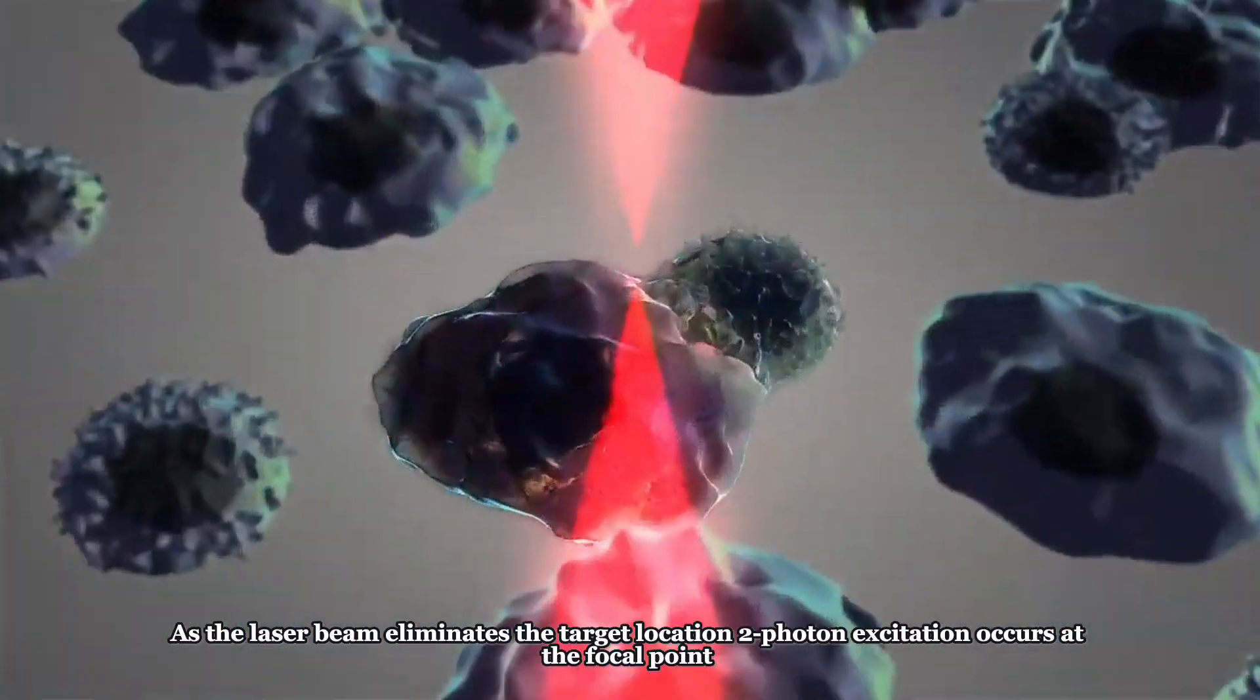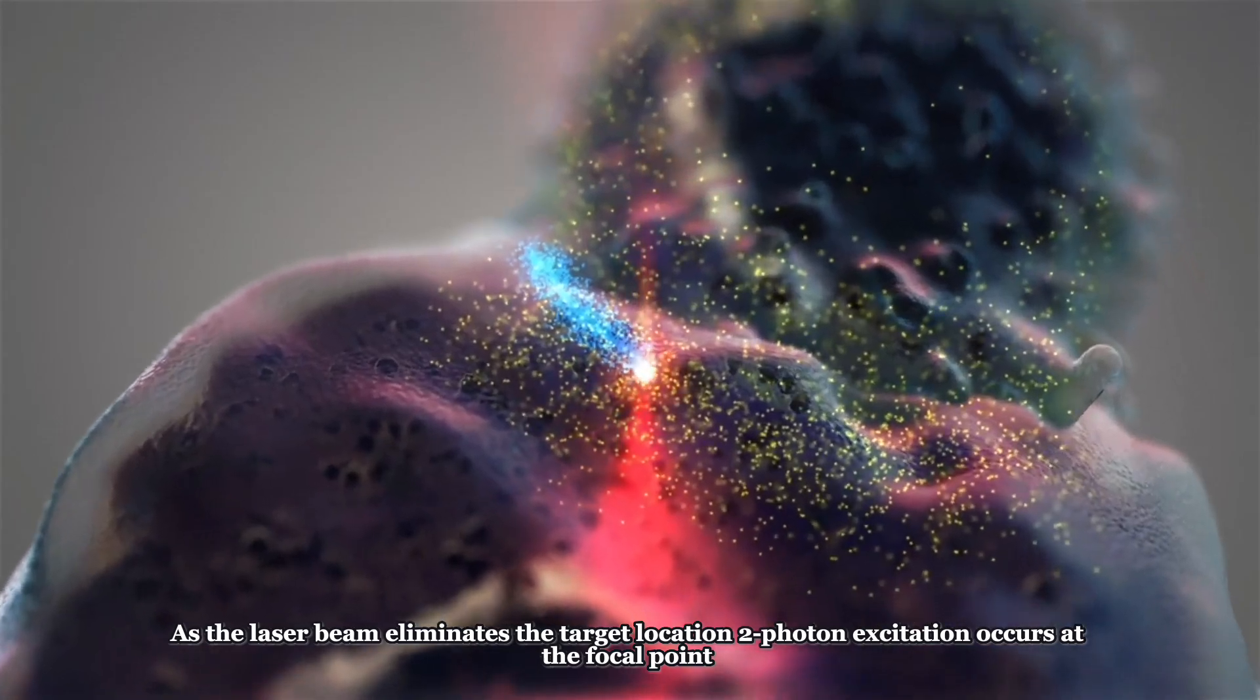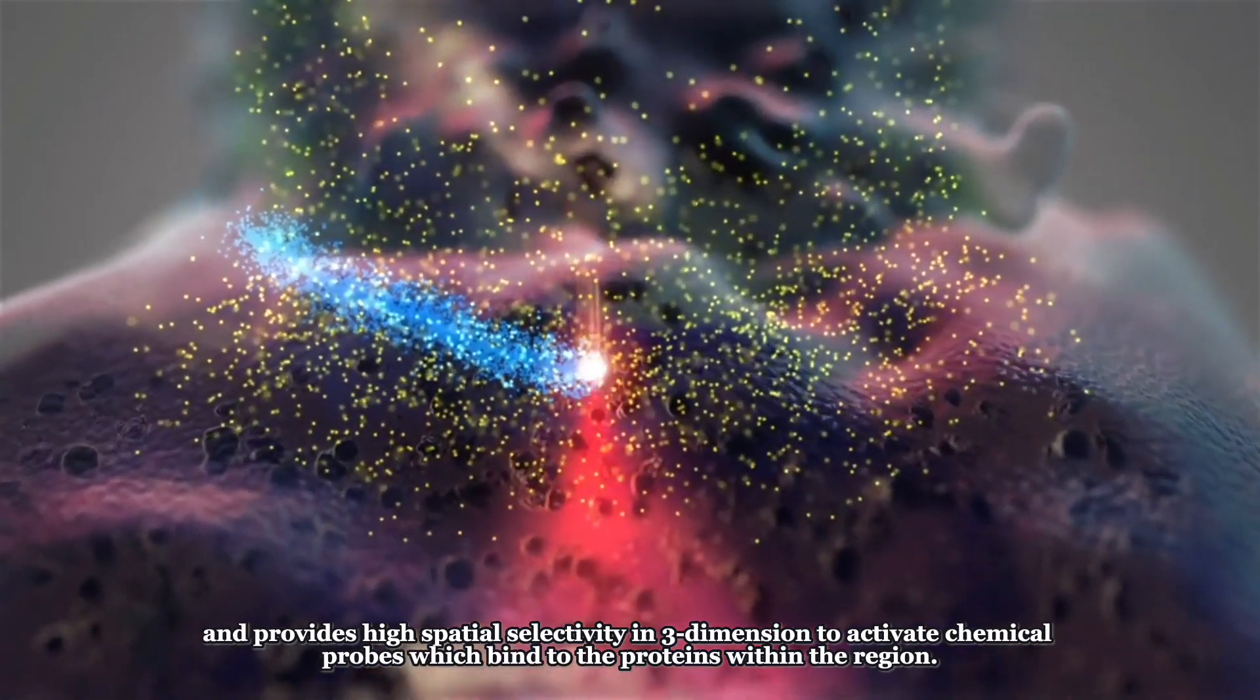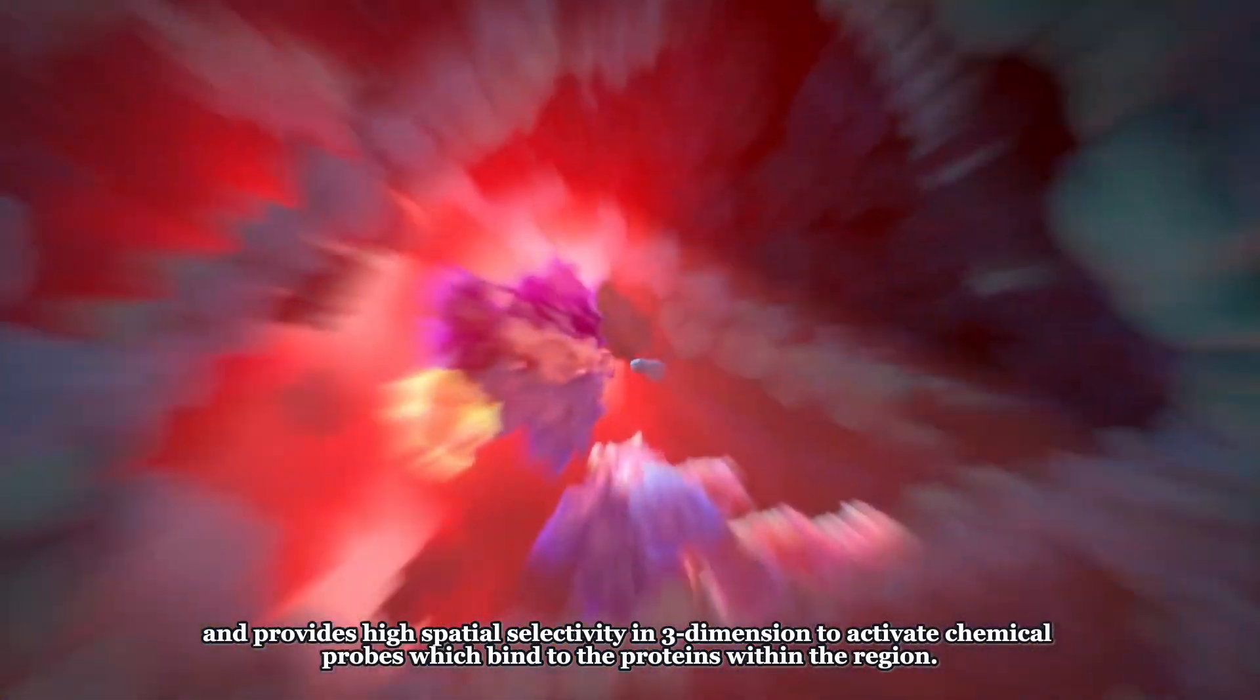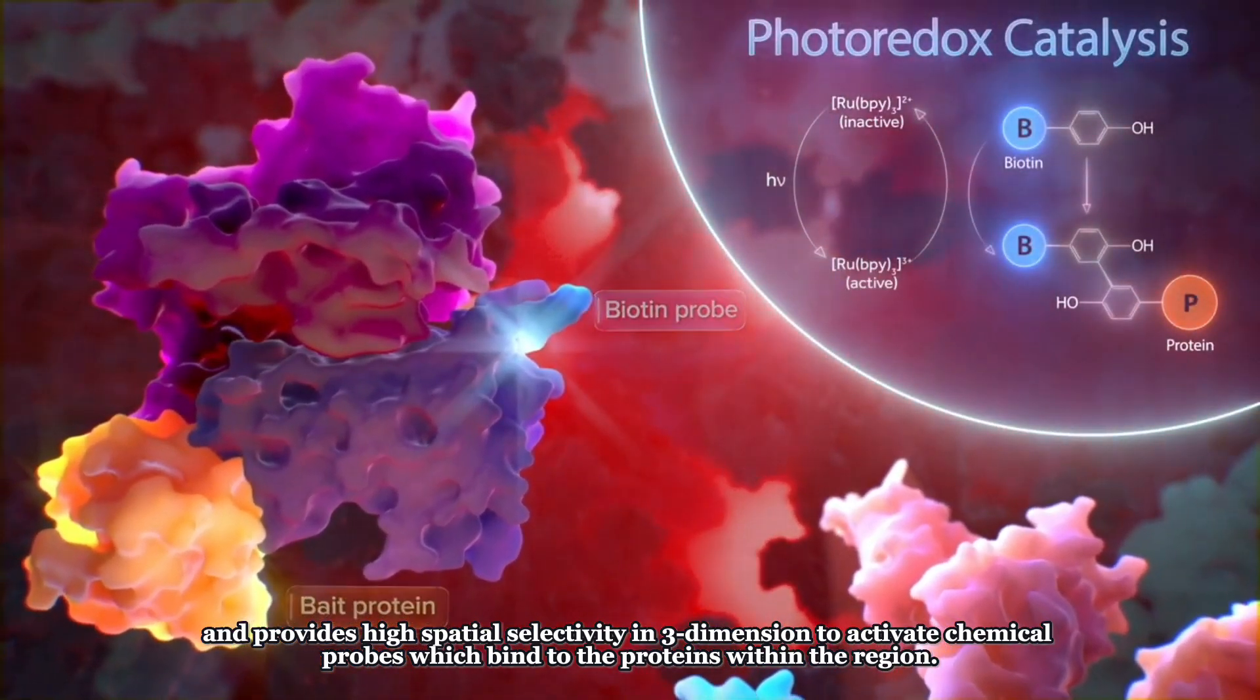As the laser beam illuminates the target location, two-photon excitation occurs at the laser focal point and provides high spatial selectivity in three-dimension to activate chemical probes which bind to the proteins within the region.